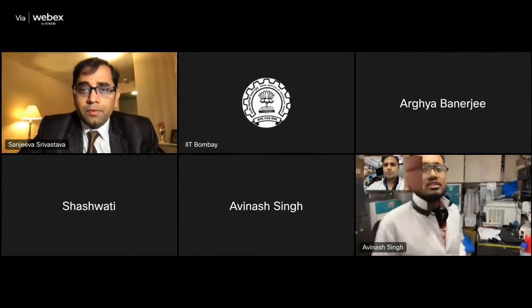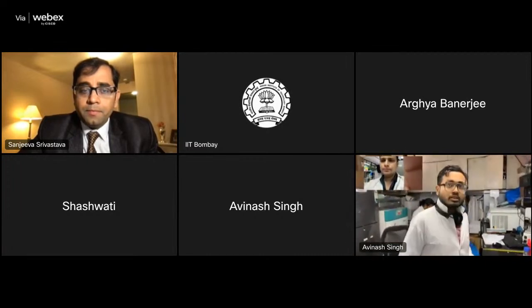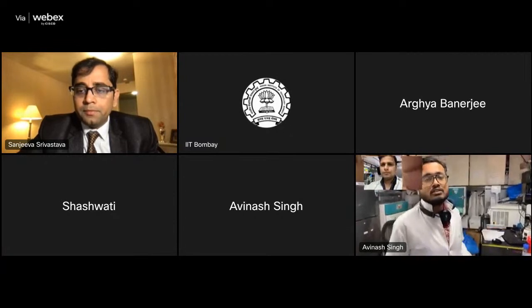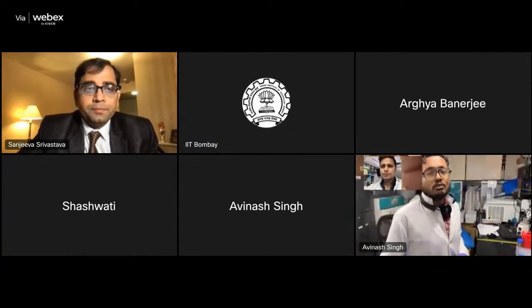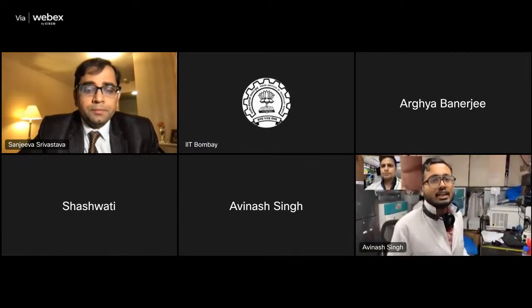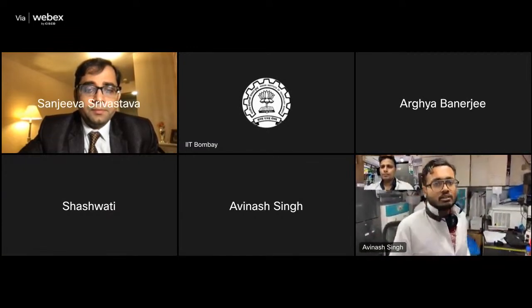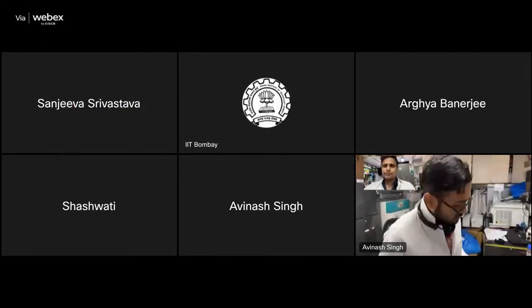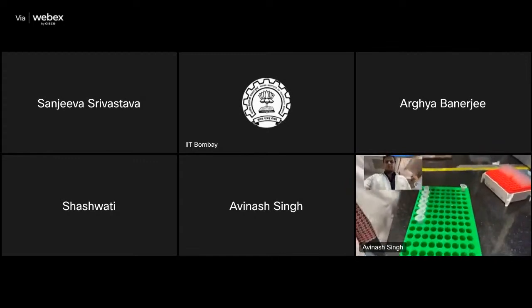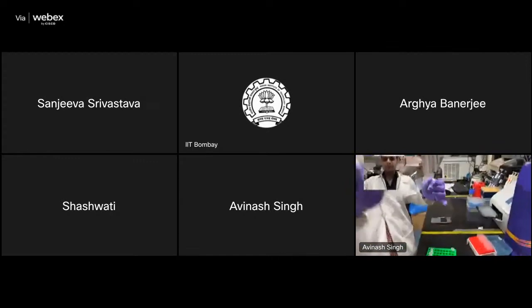Yes, good morning, everyone. I'll be demonstrating how to do the protein quantification. As I mentioned, we first need to quantify how much protein we'll be digesting and how much protein is present in the unknown sample, so that we can take the equivalent volume of protein for digestion. For that, we use the Bradford assay for the protein quantification.